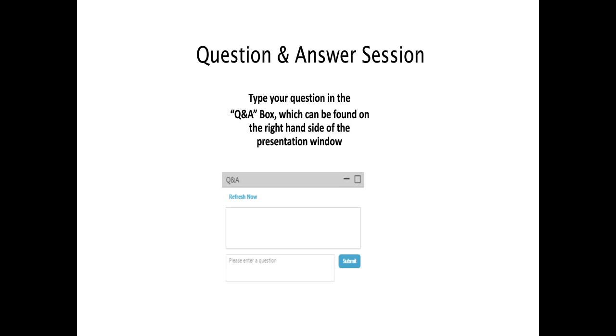Thank you. Next question. Is it possible to develop a single HILIC method for a mixture of acidic, basic, and neutral analytes? Oh, absolutely, and I hope from all the examples that I've shown you, that is absolutely achievable.